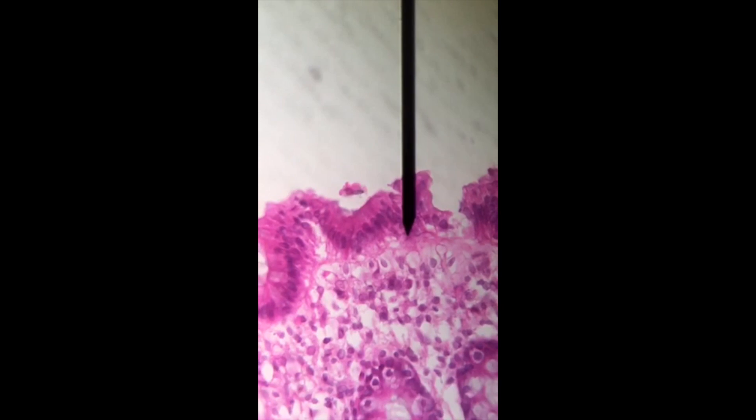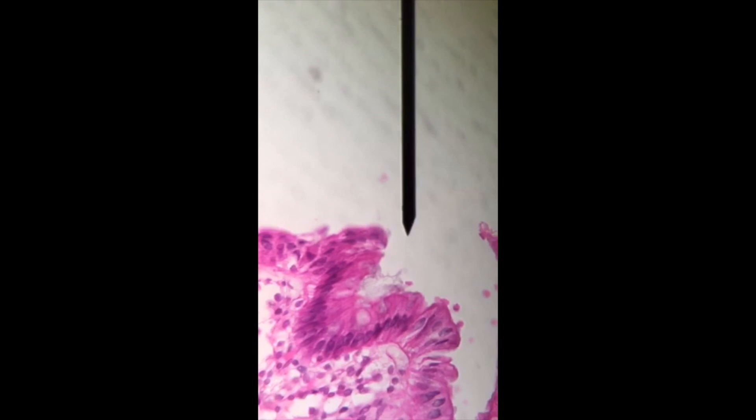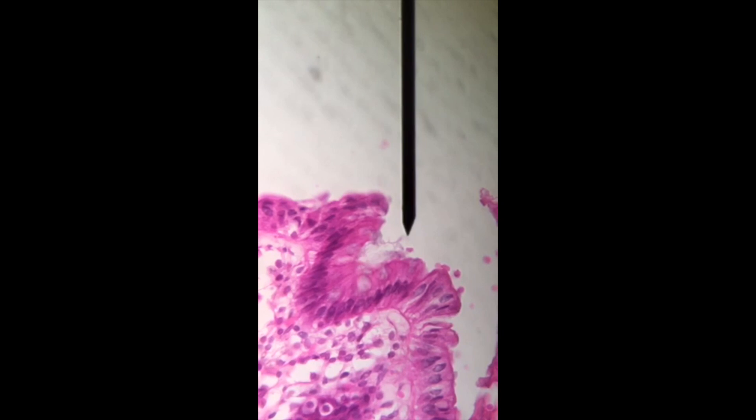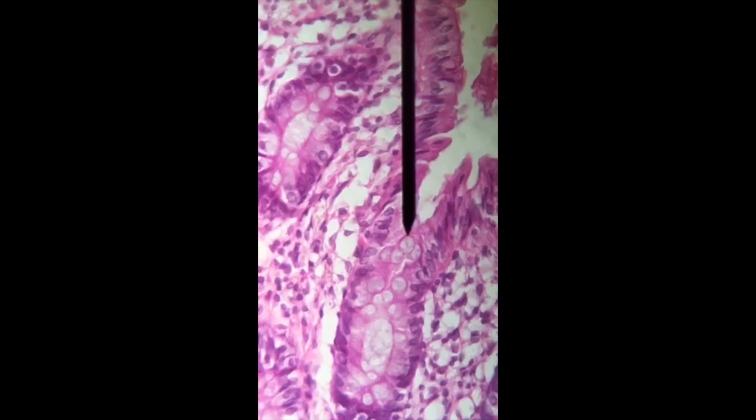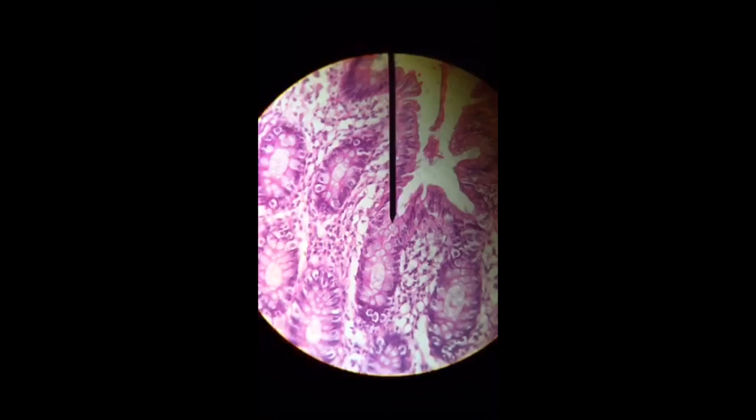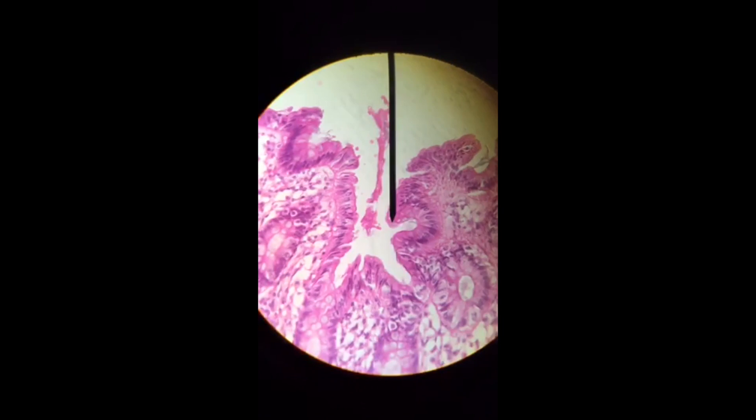And we're going to see as we move around, we'll see some nice goblet cells that are going to line this. We're going to have a lot of goblet cells in these structures. It's going to secrete a lot of mucus. There's another gland within the crypt, our intestinal crypt, our crypt of Lieberkühn.